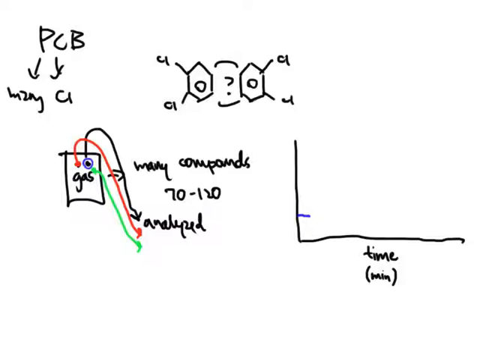And when that particular component's seen, we see a huge peak that begins to get formed on the chromatogram itself. And then sooner or later, that peak has to come off. And when that peak comes off and there's less and less of it, we see this graph come back down to the starting line.